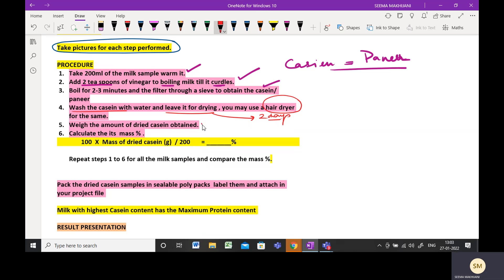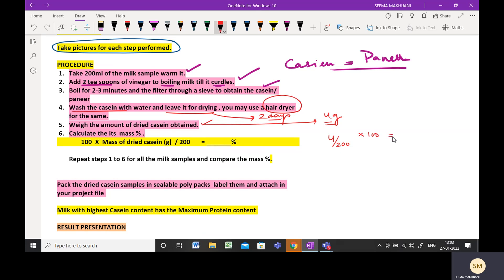Now weigh the dried casein you have obtained. After this, calculate the mass percentage. For example, if your casein weight is 4 grams, you take 4 divided by 200 ml of milk, multiplied by 100, to get your result in percentage. The formula is: mass percentage = (mass of dried casein / 200) × 100.